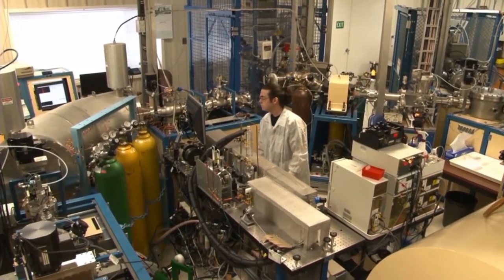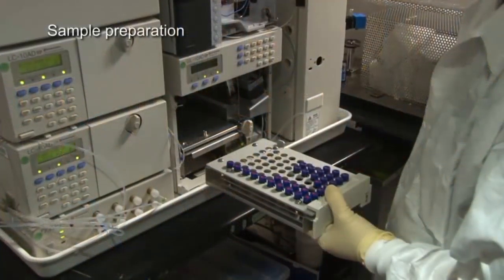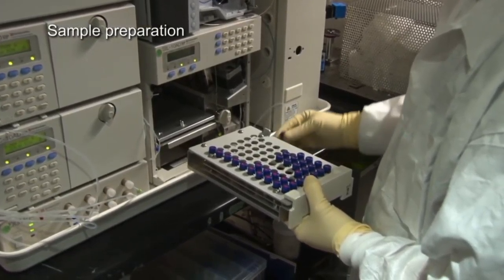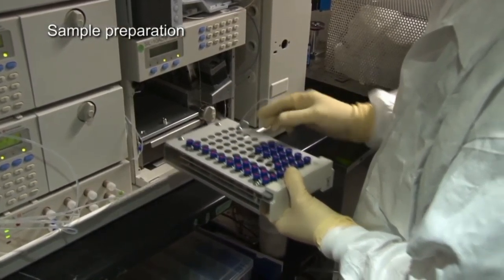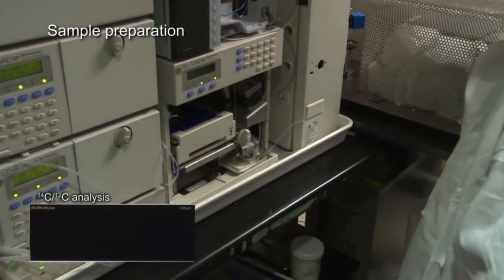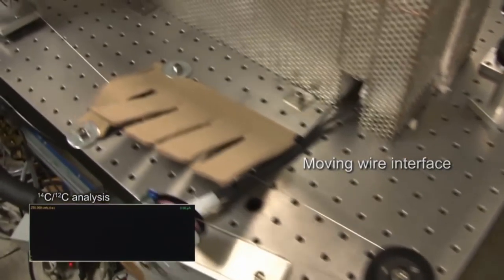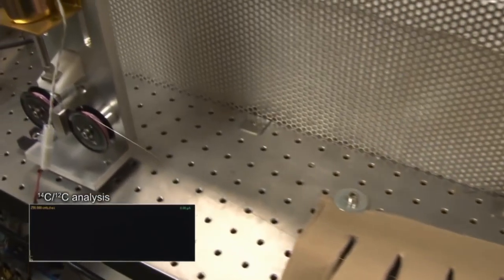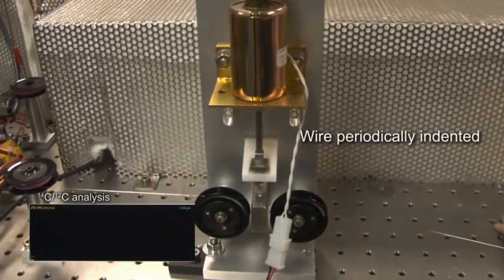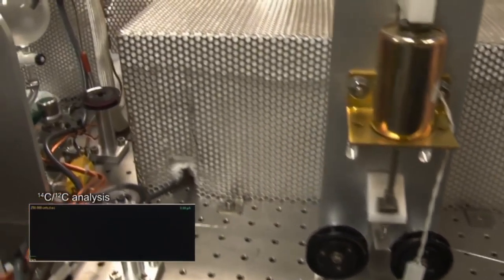So this is one of the setups we have out at the lab of one of the AMS machines. We take the sample, and we put it in these little vials, and then the different chemical components get separated by what's called an HPLC. So through chromatography, each chemical gets separated out. And then as those chemicals get separated out, we have this moving wire interface where the wire goes along on this pulley system, and it gets little dents put on the wire. What that does is allow the liquid to stick to the wire better. Otherwise, it kind of coalesces or falls off.